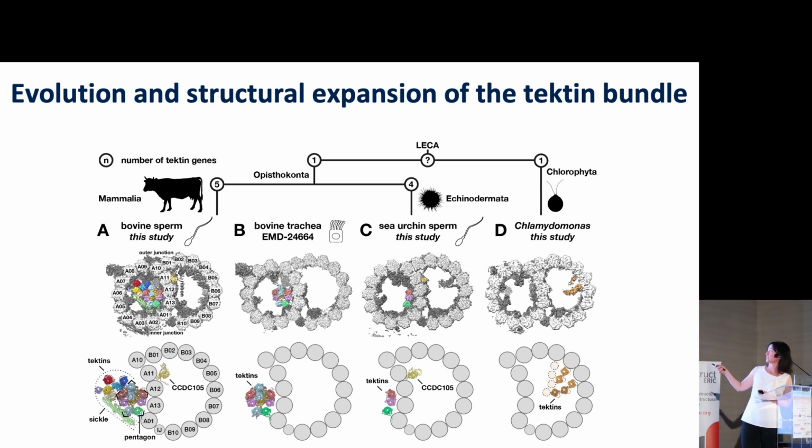So these are all these tectin 5 here. Now I show only tectin 5. And this is the same protein, bear in mind, but you see the same protein actually forms different conformations within the same assembly. So now first I'll show you a normal filament if you want. This is how tectin 5 will form. So these are the red ones.